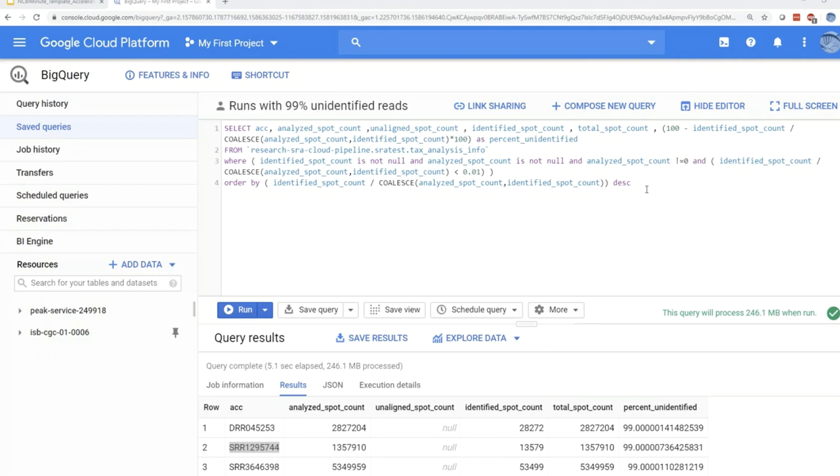Okay, another question, which I think you addressed, and in some ways this webinar was about this very topic, but it's probably worth reiterating. So the question is, what is the advantage to use an EC2 instance instead of using my own computer, which is basically using the cloud instead of this person's own computer? So maybe there's just a couple of points to finish things off. If you're downloading data using the SRA Toolkit, it usually pulls data from our servers, but that's also where everybody around the world is accessing the data as well. So you're obviously competing for resources there. In the cloud, it scales basically automatically. You get faster access to the data there as well.